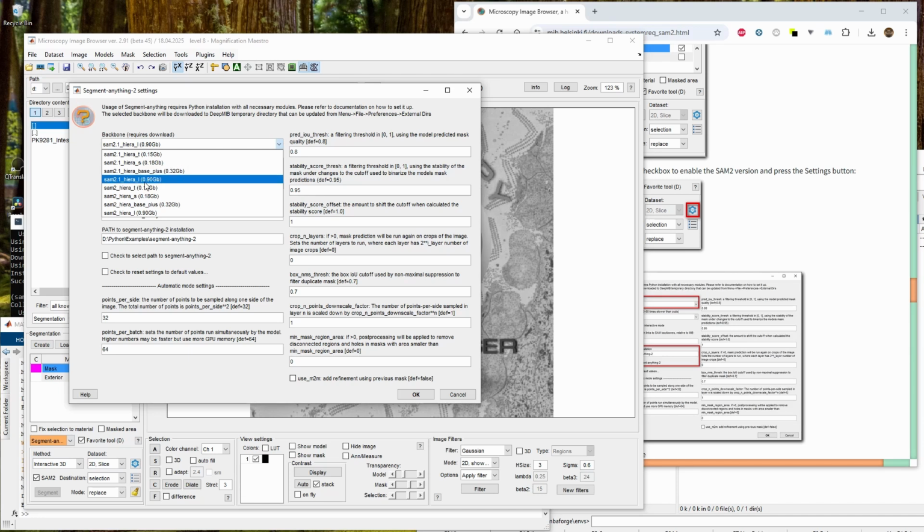The larger this value is, the more GPU memory it will use and the more parameters it has. It is more powerful, but it will potentially require more GPU memory and will be slightly slower. But in my case, I can really afford to use this one, so I just press this one.